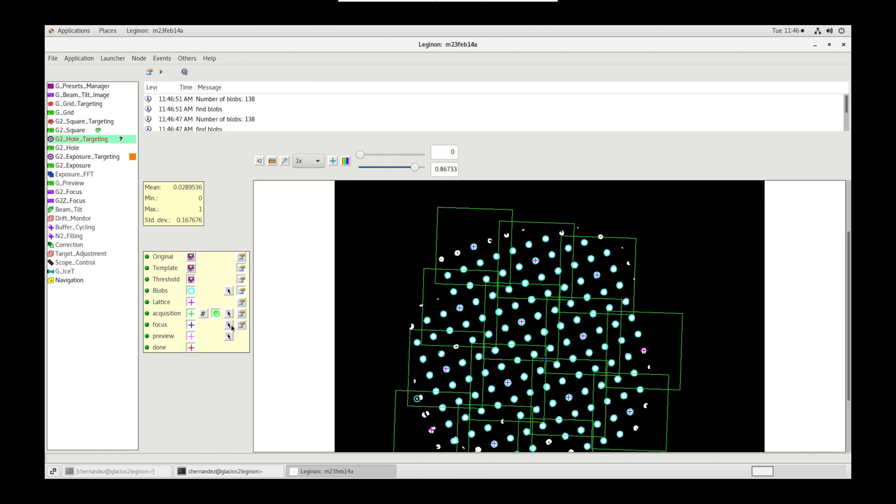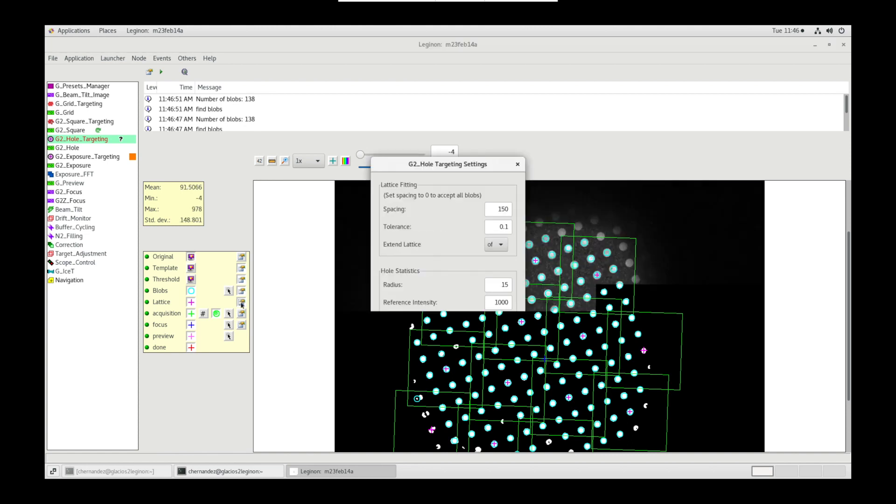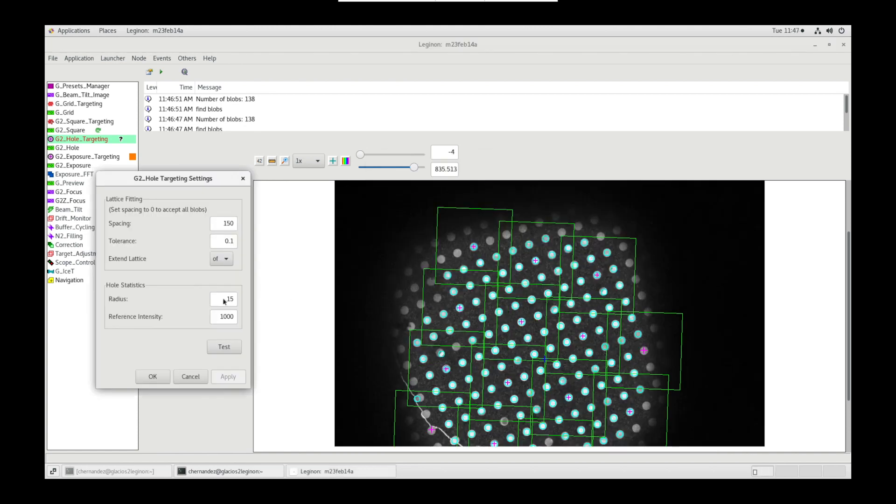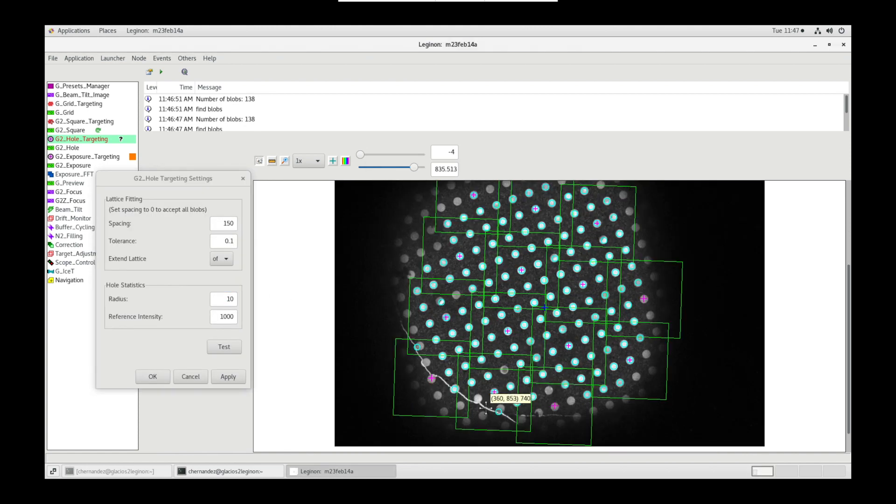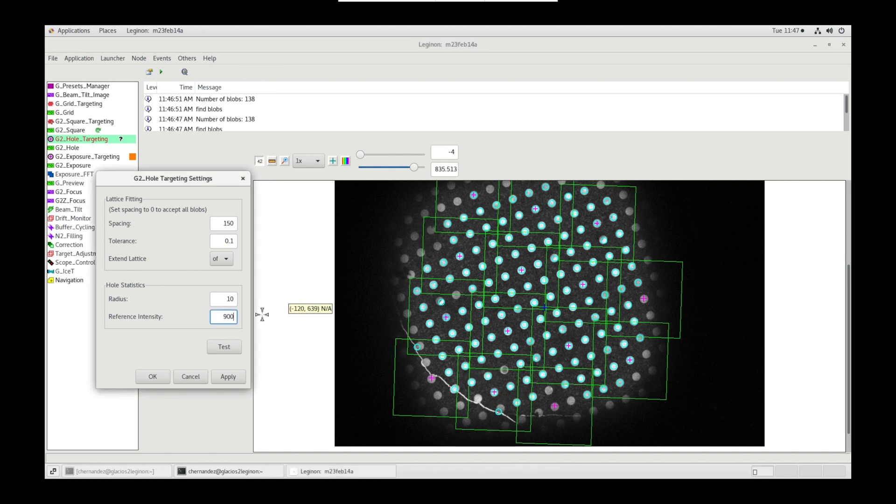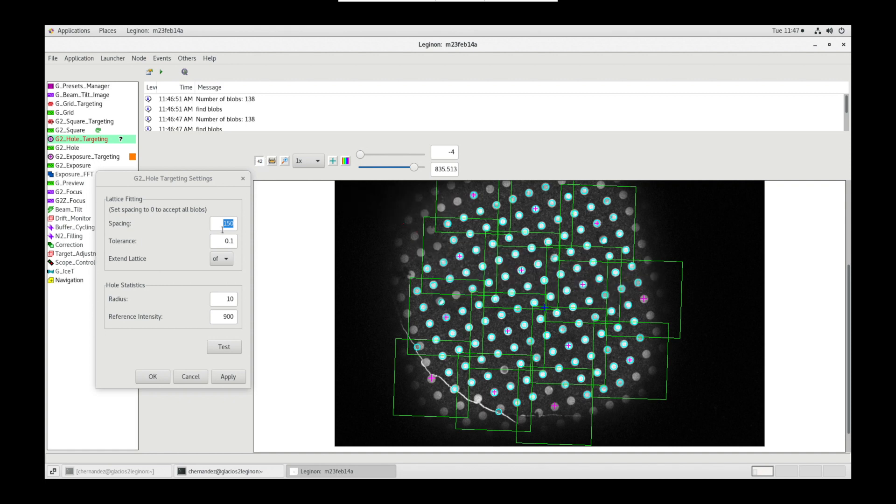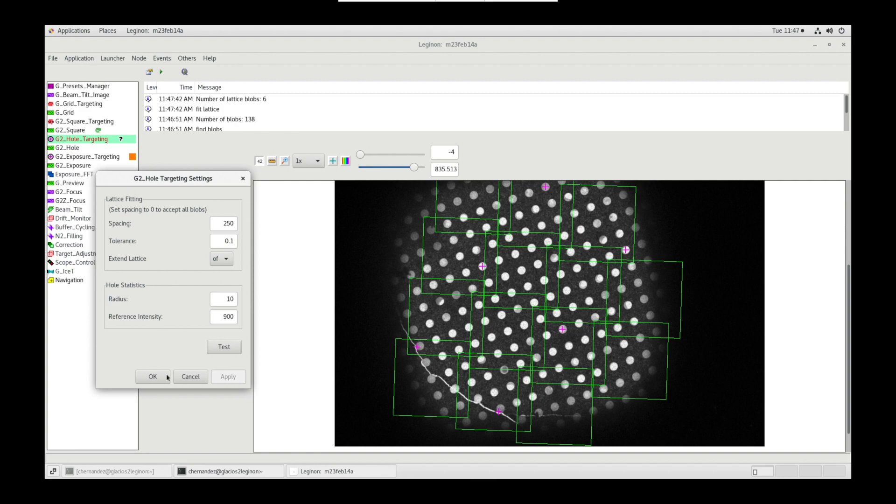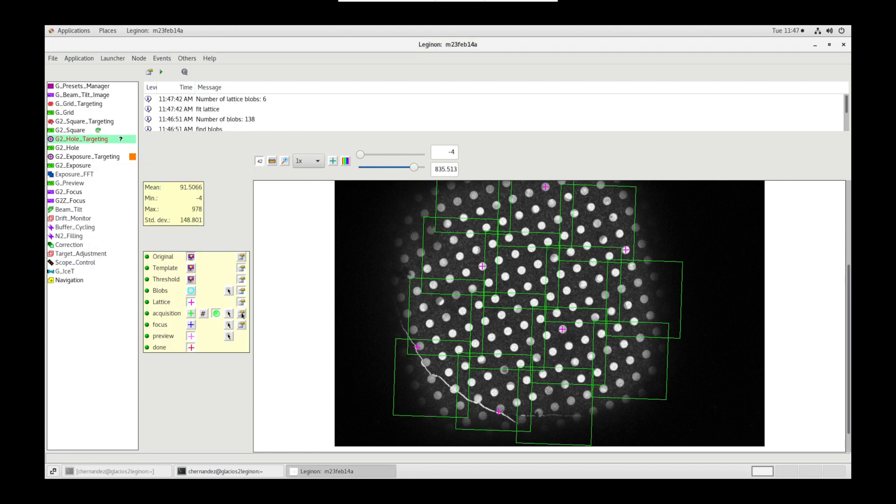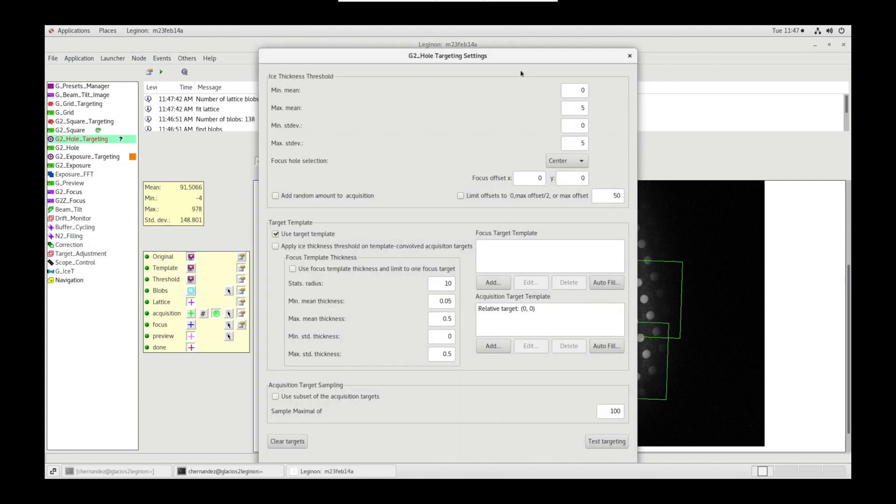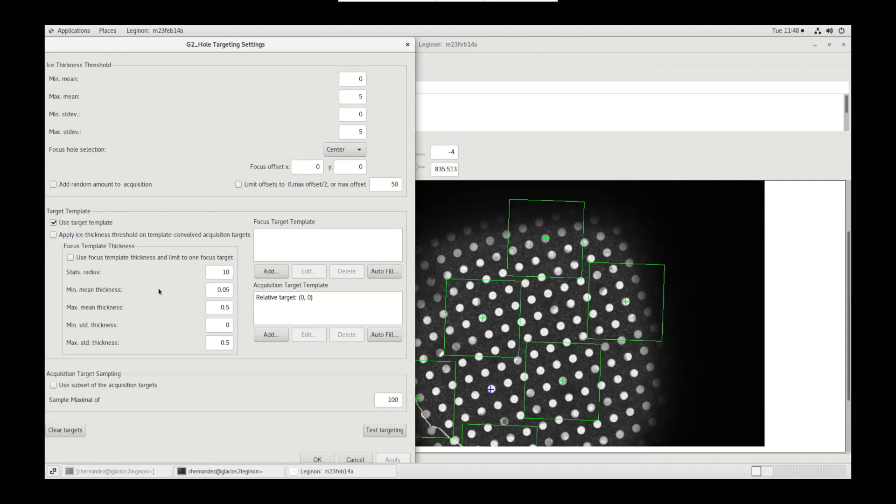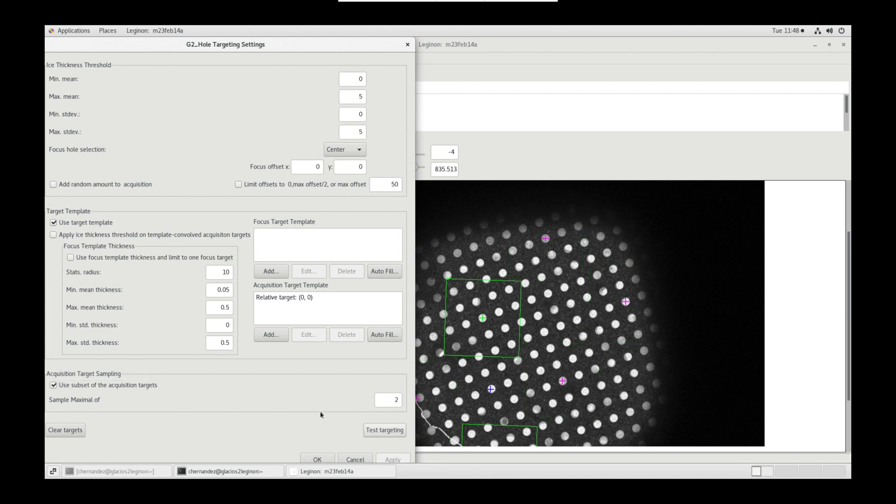In lattice settings, input the radius of the holes. Then use toggle value to show values of lighter or empty holes to get an average reference intensity value for a vacuum. Spacing allows us to distance our targets so that we do not double dose the same areas when targeting later. Finally, in acquisition settings, under acquisition target sampling, we can toggle use subset of the acquisition targets and set a value. For screening, I use two.